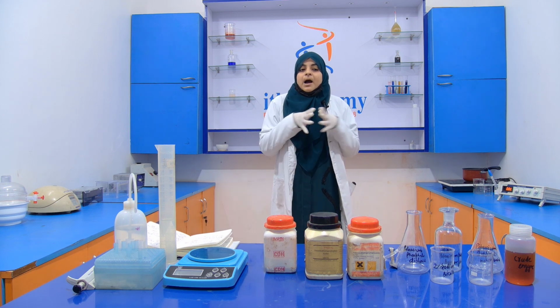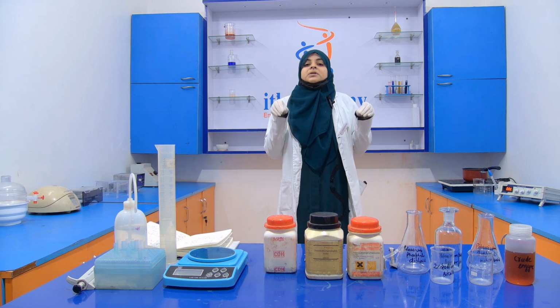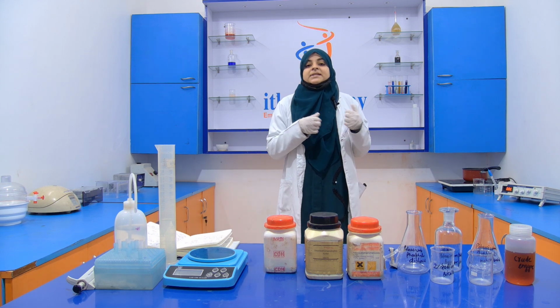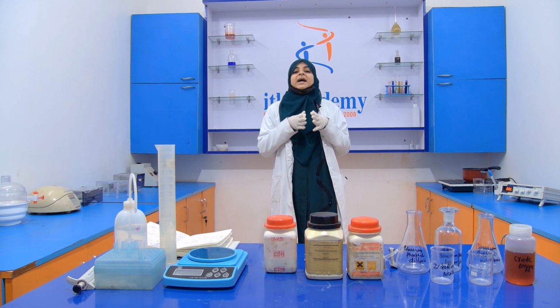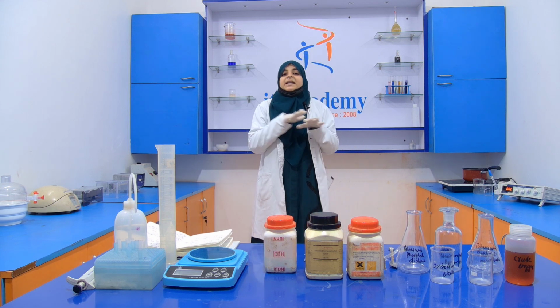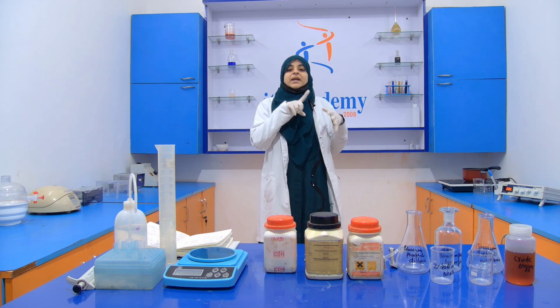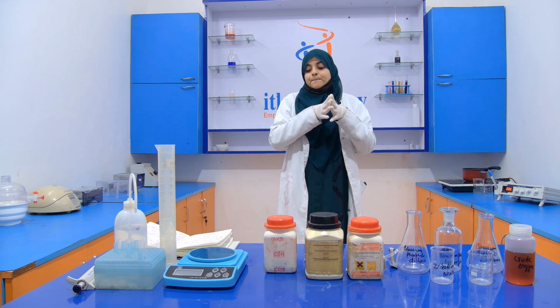So simply, what is a protein? Protein is a polymer of hundreds of amino acids, and these amino acids are linked together by a bond called a peptide bond. Proteins are present in different structures: primary, secondary, tertiary, and quaternary. These are the structures of the protein.